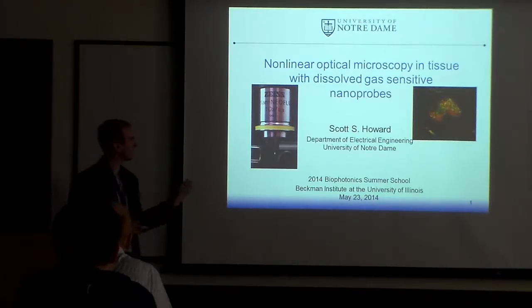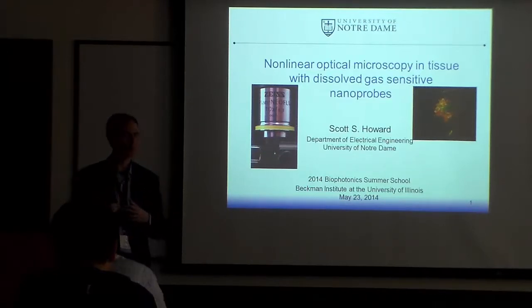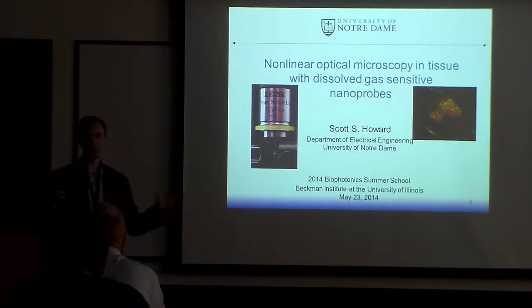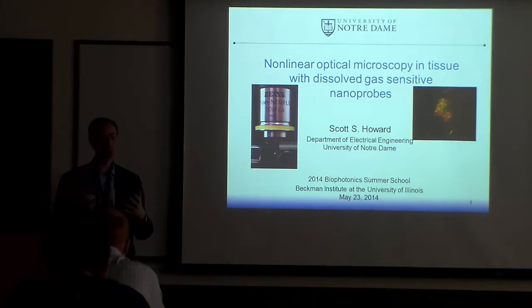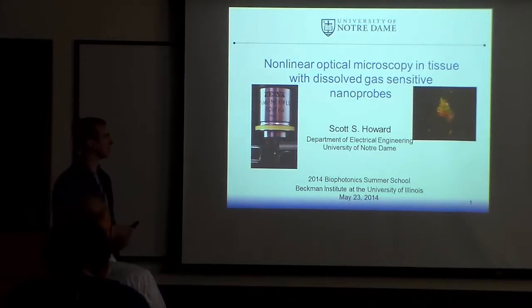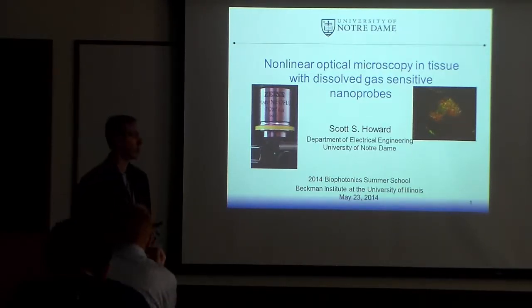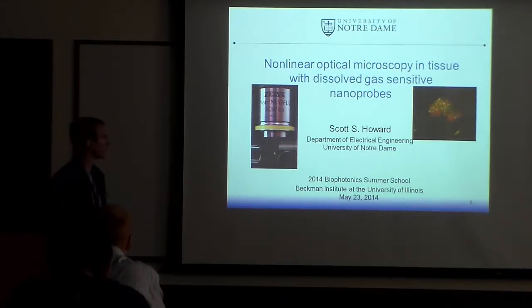So I've been thinking about ways of getting quantitative measurements of chemical species at the hundreds of nanometer scale you can get with nonlinear microscopy, and so we'll have a little introduction to that. And since this theme is nanophotonics, with a lot of plasmonics and nanoparticles, I took a chance this past week to catch up and read about how people are using nonlinear optical microscopy with these nanophotonic probes, this hybrid of nonlinear and plasmonic microscopy, and there's some pretty impressive stuff going on. So I hope to give you a good introduction to the fields I work with, nonlinear optical microscopy for nano imaging and nano detection, and also the plasmonic work going on.